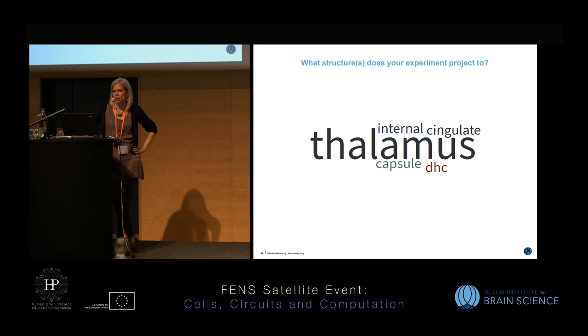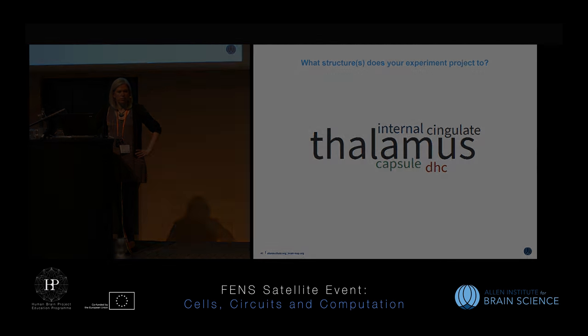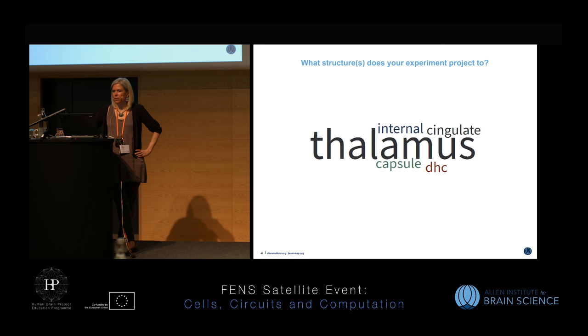Oftentimes this takes a long time to load up anyway. But you can open up the high resolution image viewer here and then open up the reference atlas. As soon as this loads up, I'll look and see. That's another way to take a look and see where the expression is or where you project to. In fact, these buttons are very useful.